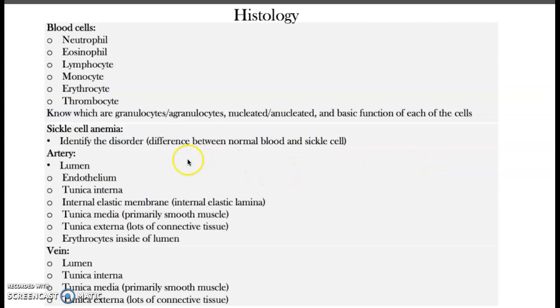In this video, we're going to be studying the blood vessels. We're going to be studying the arteries and veins. In the artery, we have to identify the lumen, which is the space, or what should be the blood.